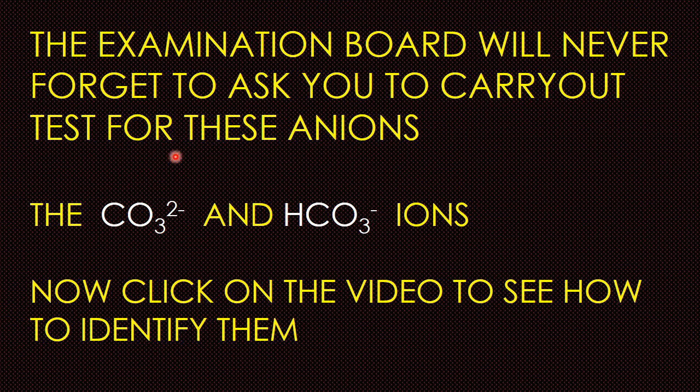Okay, so guys, this is one of the experiments in the laboratory that the examination board will never forget to ask you to carry out. Once you're entering the laboratory, expect to see these two ions. So guys, how do you test them now? We are going to find out in about a minute's time.